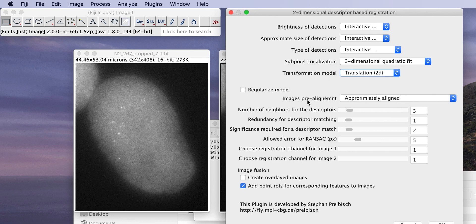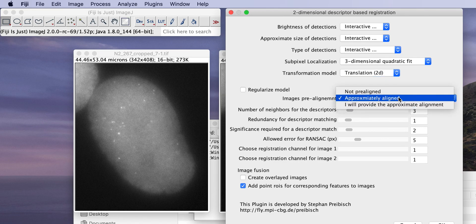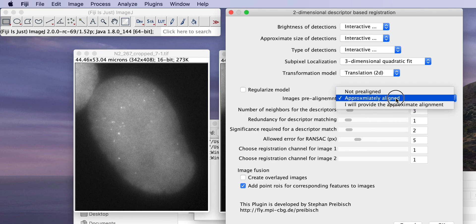It asks if the images are pre-aligned, yes or no. If they are pre-aligned, that only does the translation invariant matching. That means that this is faster and more robust, but the rotation can be up to five degrees. If the images are rotated to each other more than that, that doesn't work. In this case it is approximately aligned, but if you choose not aligned you can also provide the transformation if needed.